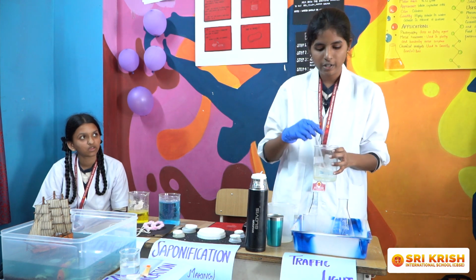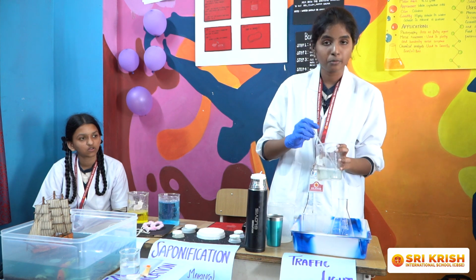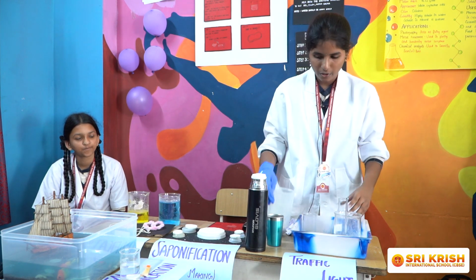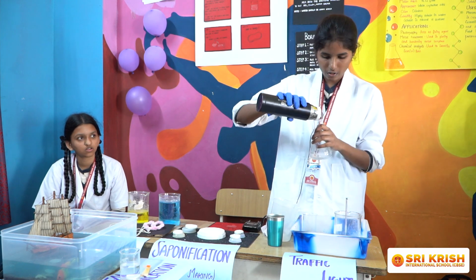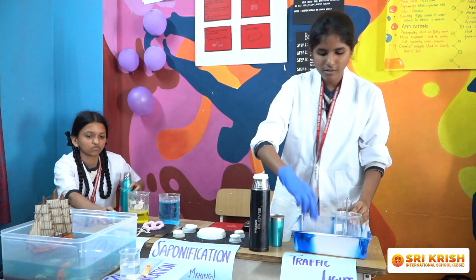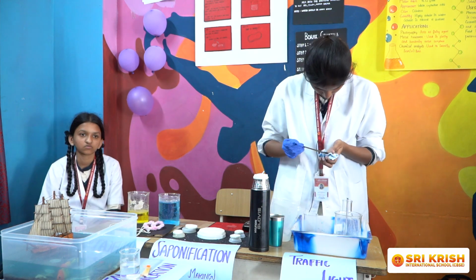Note that the water should be warm, not too cold and not too hot. Another solution is prepared by using 100 ml of water. To this 0.01 gram of indigo carmine is added.